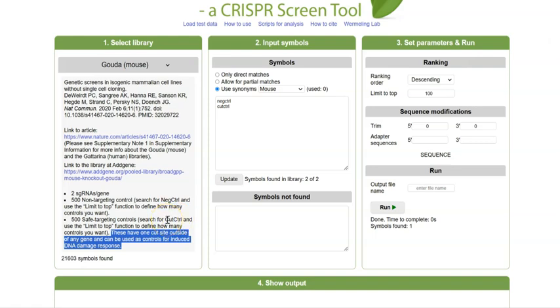They probably will more likely negatively impact your cells than the non-targeting control, as you have this p53 activation, this DNA damage response. Although keep in mind that many cell lines have mutated p53. So if you're working with standard cell lines, there's a good chance that they are mutated for p53. And then they don't necessarily have much of a DNA damage response, right? Although there could be subtleties in that. So that's how you use them.